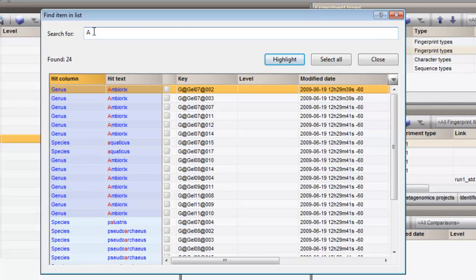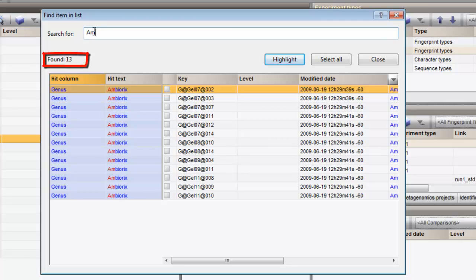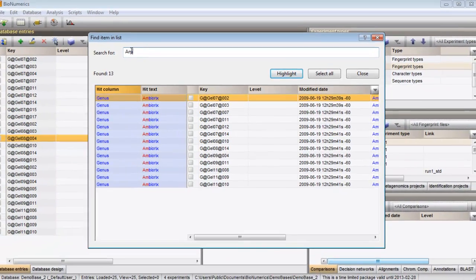The display gets updated with the database entries that fulfill the search criteria. In my database, 13 hits are found. Pressing the Select All button selects all Ambiorics entries in the database.